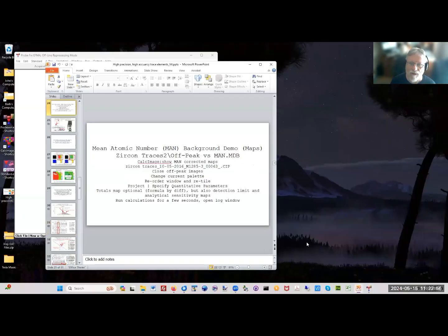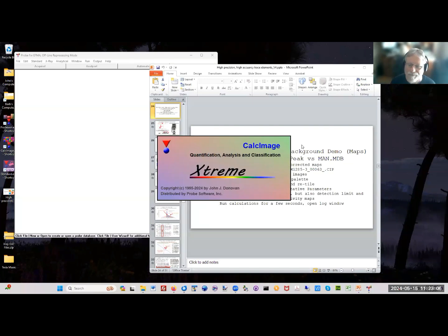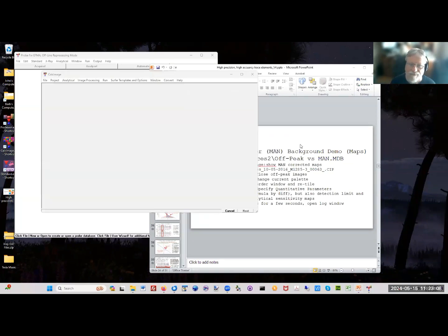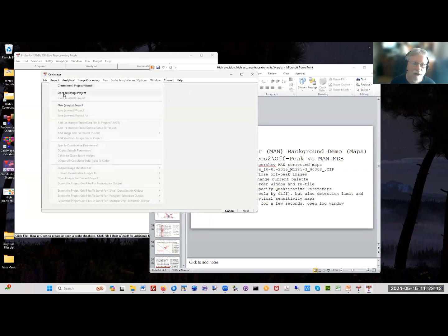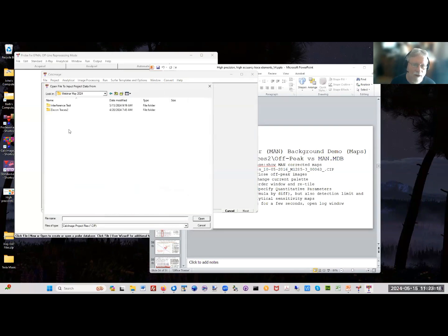Okay, and now I will show you an example of that. So we're going to look at maps. So we'll pull up our CalcImage software. All right, so let's open a project. And we'll go down to the webinar. Let's see, zircon traces. And I made a copy of each of the maps, and I processed one with off peaks and one with MAN. So I can compare those maps as you just saw in the PowerPoint.